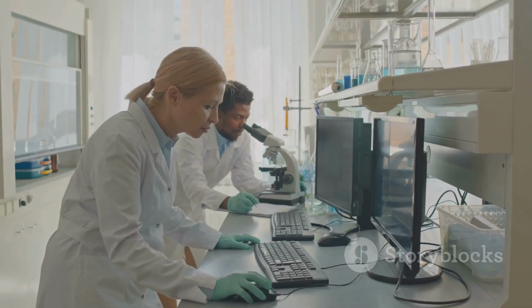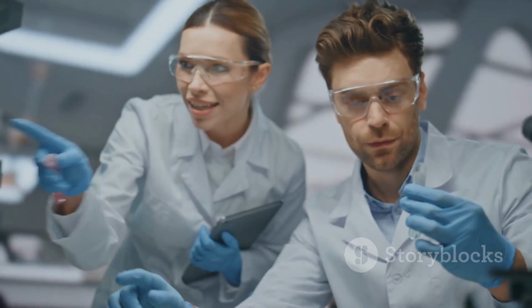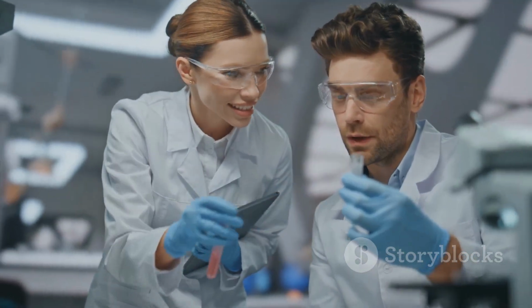By removing these confounding factors, batch normalization improves the accuracy and reliability of RNA Seq analysis, especially in large-scale studies.